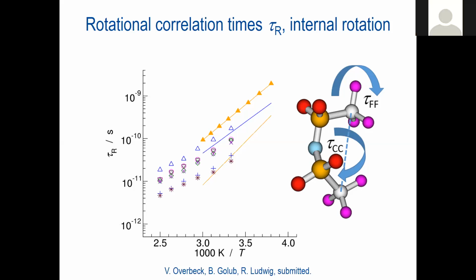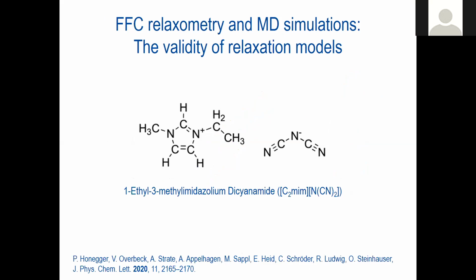So my last example is one we published recently with our colleagues from Vienna University, Ottmar Steinhauser and Christian Schröder, where we compared fast field cycling relaxometry data with molecular dynamic simulations.